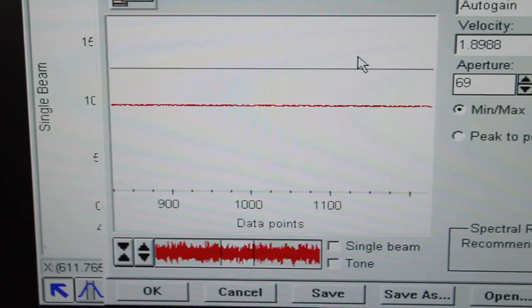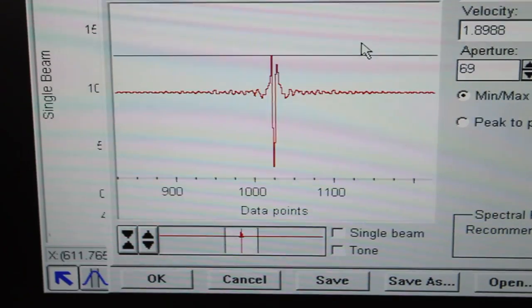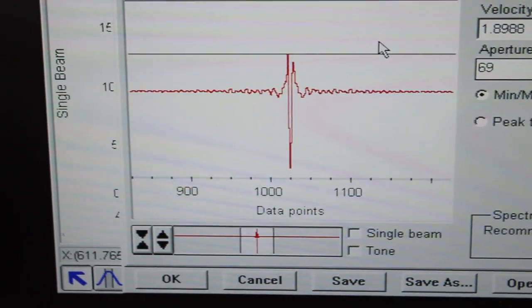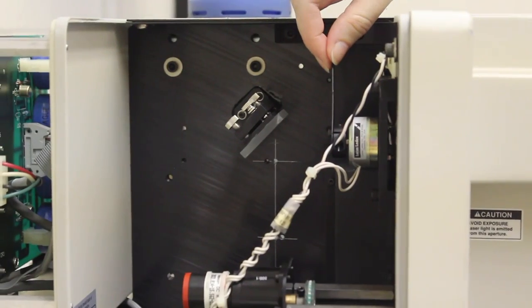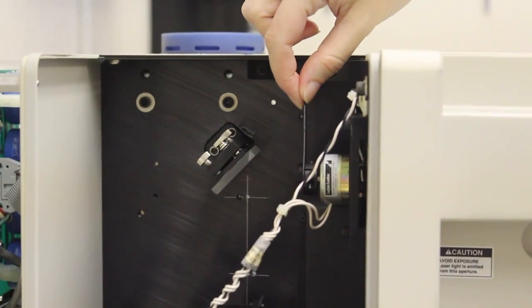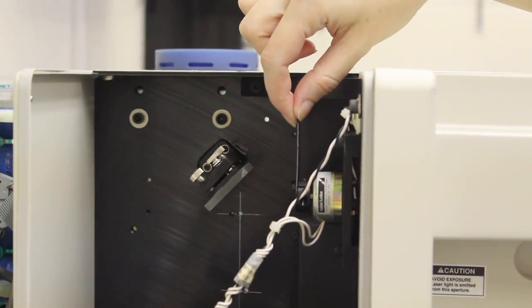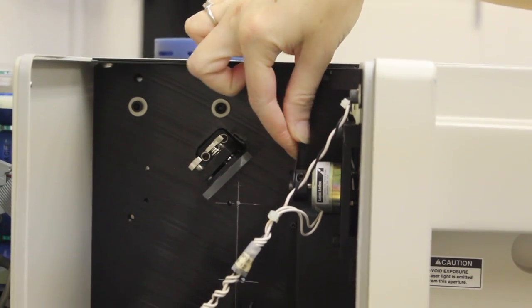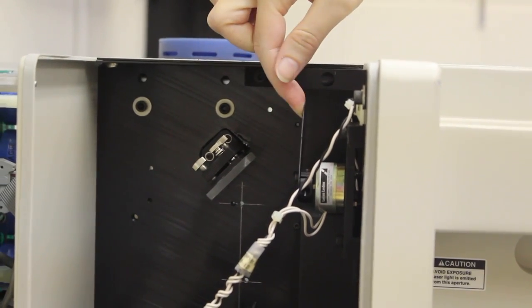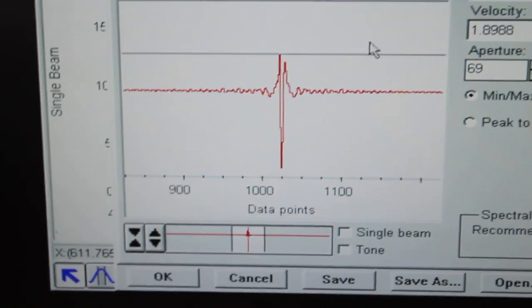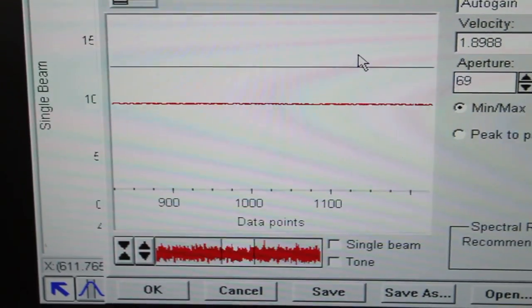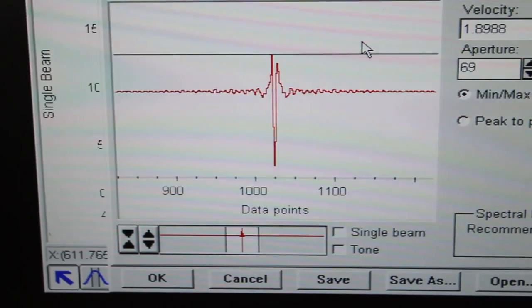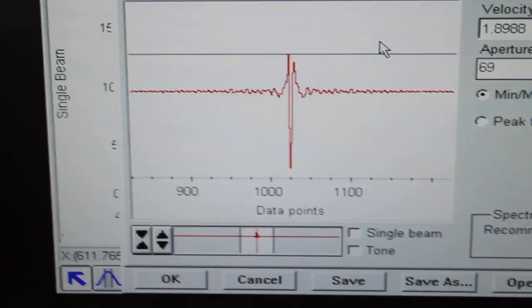This is an interferogram, which is blocked when the light is blocked from entering the microscope. You can see here this little flipper motor blocks light to the microscope, and when it does so, the interferogram disappears.